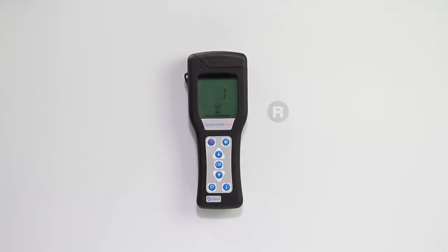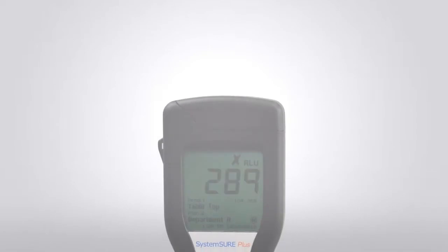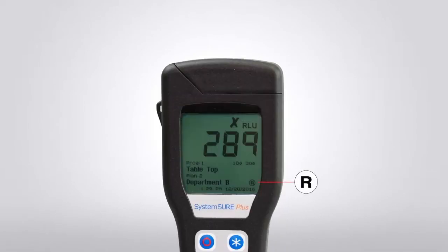Retested locations are indicated by an R in a circle. Retest results are indicated by a white R in a black circle. Please note that retests can only be performed on failed test results.